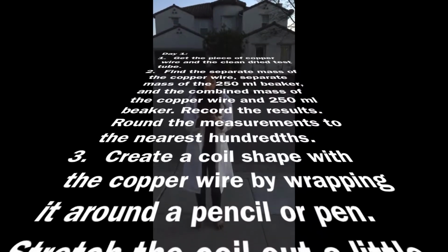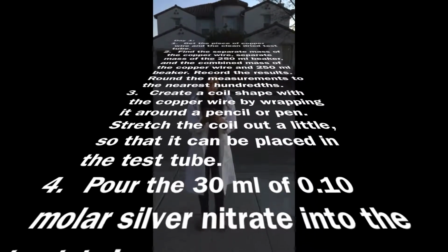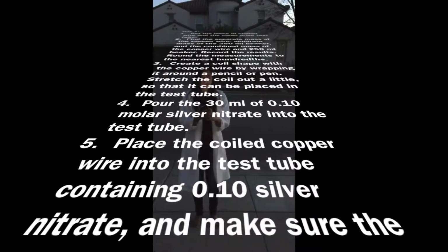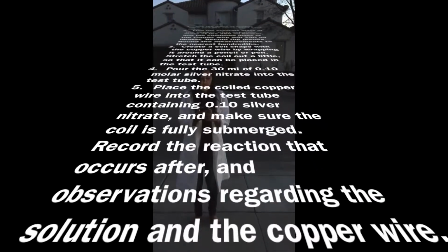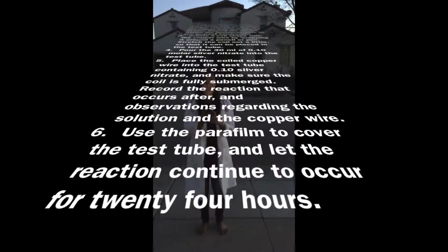Step 3. Create a coil shape with the copper wire by wrapping it around a pencil or a pen. Stretch the coil out a little so that it can be placed in the test tube. Step 4. Pour the 30 milliliters of 0.10 molar silver nitrate into the test tube. Step 5. Place the coiled copper wire into the test tube containing 0.10 molar silver nitrate and make sure the coil is fully submerged. Record the reaction that occurs and observations regarding the solution and the copper wire.